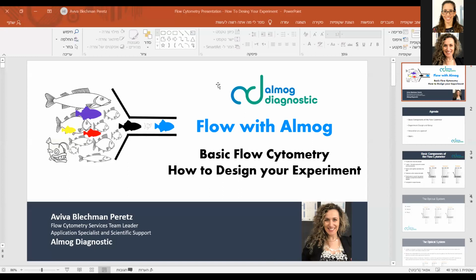How do I choose the voltage correctly, how do I perform the voltage settings? So the voltage settings are done with your cells, with your single stains. The best way to do it is with your single stains. You should always be sure that the signal is inside the plot and doesn't reach the borders of the plot. I mean, you have to see a good positive signal in the middle of the plot. You should set the voltage so that you can distinguish between the positive and negative signal, but still the signal does not run out of the plot.